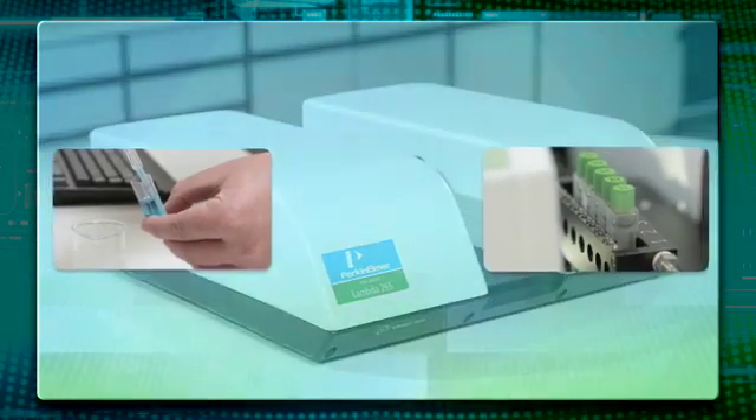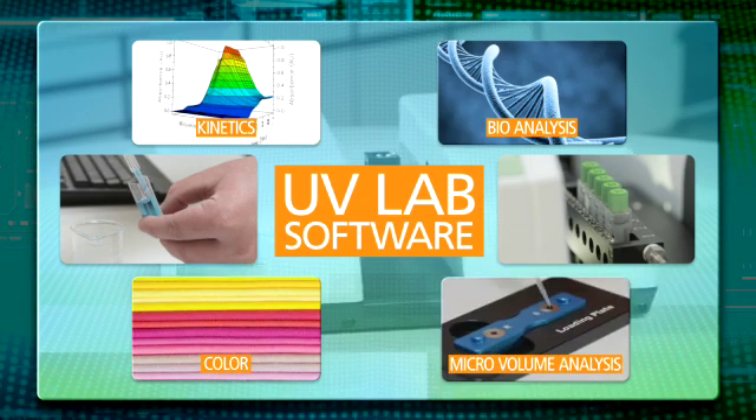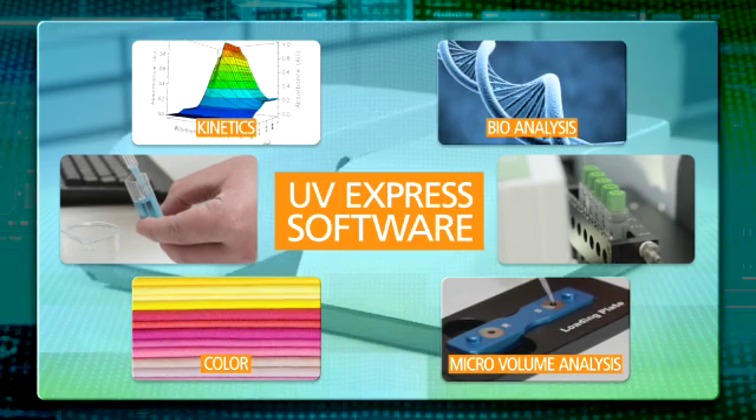The Lambda family uses UV software which is a fully integrated solution. Easy to use, with quick sample run time, and a reporting system that allows any lab to make accurate, predictable, and reproducible results.